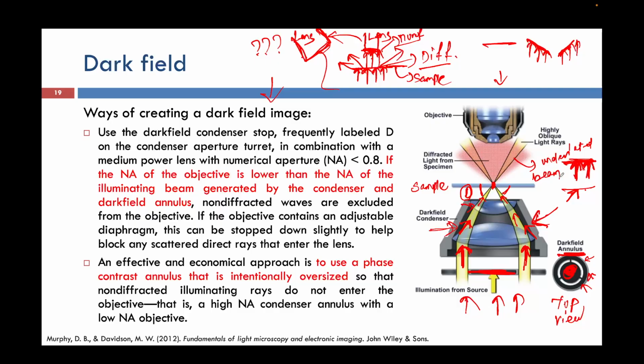Okay, and all the other beams which are coming like this, they all are diffracted beams. Same thing, if I consider this side, this is the second incident ray. For the second incident ray, this is the undeviated, or non-diffracted, ray. Okay, this is the undiffracted. But any other beams which are coming like this, they all will be diffracted beams.